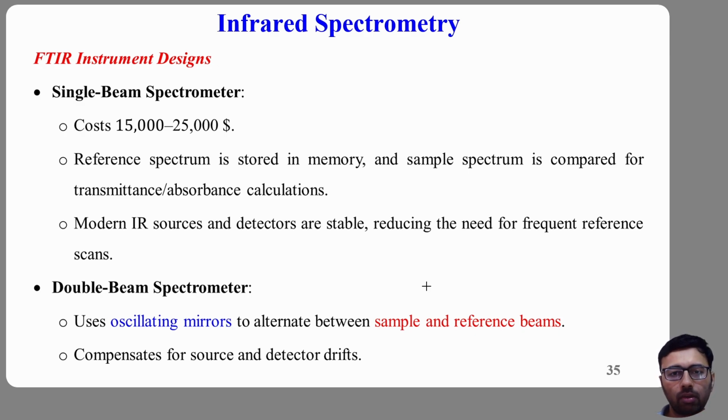This approach simplifies the optical design, reduces the moving parts, improves reliability, and lowers instrument cost. That is why the single beam FTIR spectrometer dominates modern laboratories today.